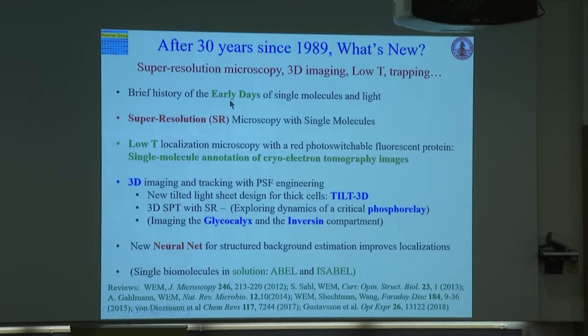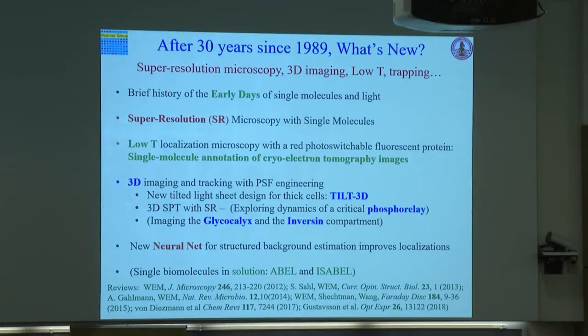I would like to talk a little bit about the original discovery and observation of individual molecules, because that's what everything followed from afterwards. Super resolution microscopy is one of the favorite applications, but it's not the only one, but I'll describe it briefly. And then talk about new work, because the question here is, of course, what's new?